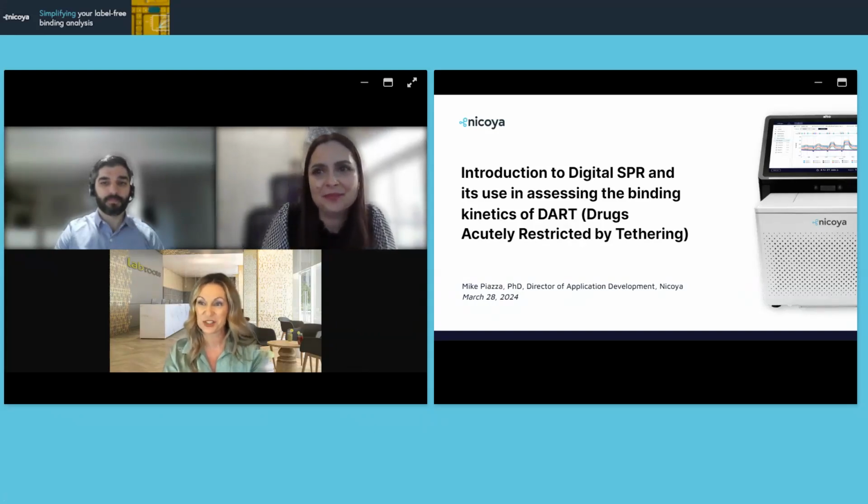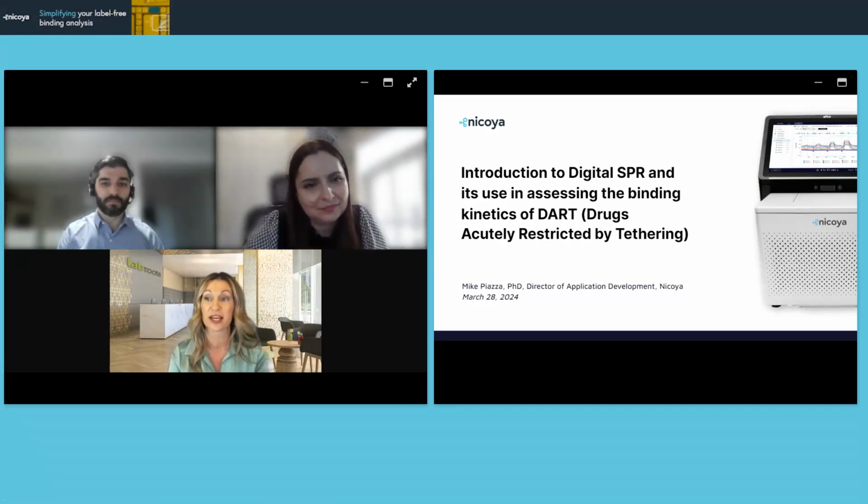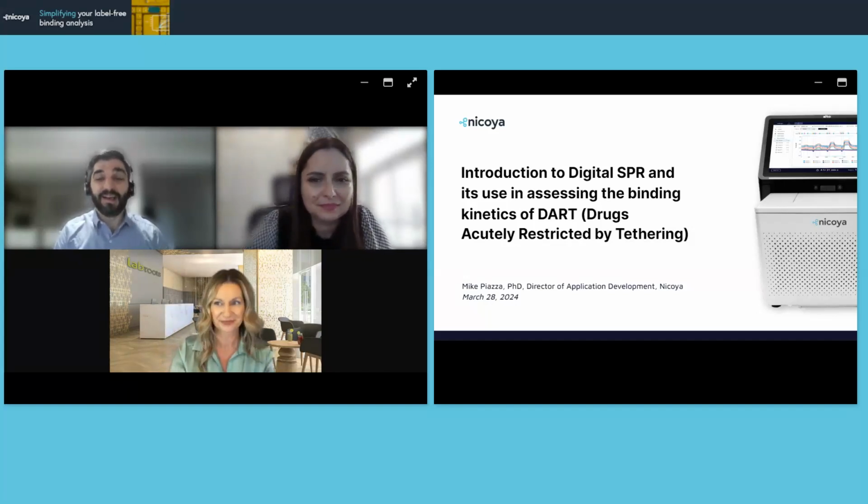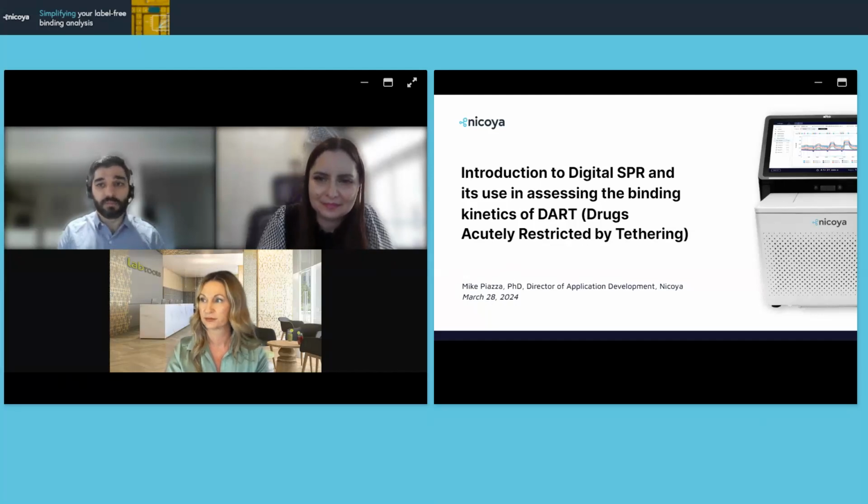Thank you. Next question. Would the epitope characterization experiment that was just presented also work with surface immobilized aptamers? I'll take that. Yeah, another good question. The actual module for the epitope binning allows for a 16 by 16 bin of any type of biomolecules that can be sandwiched together. Obviously, one of the prerequisites would be that if we're working with monoclonal antibodies, the antigens would have to be monomers with only one binding site.